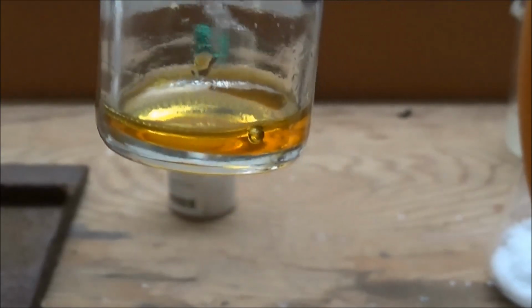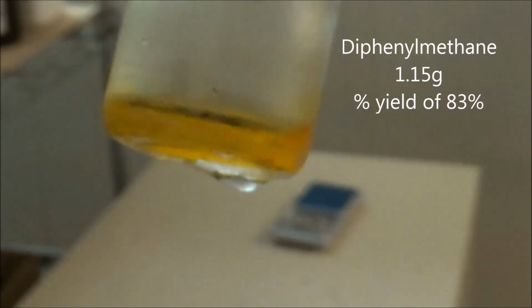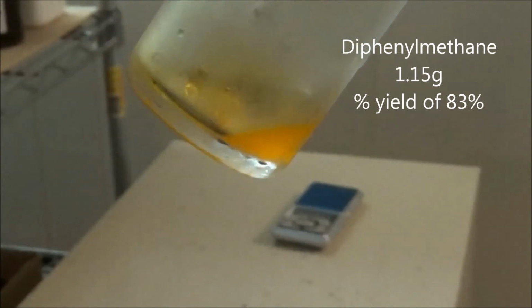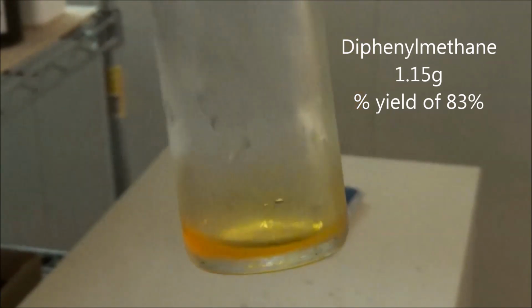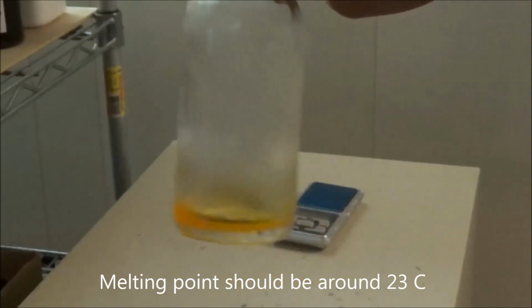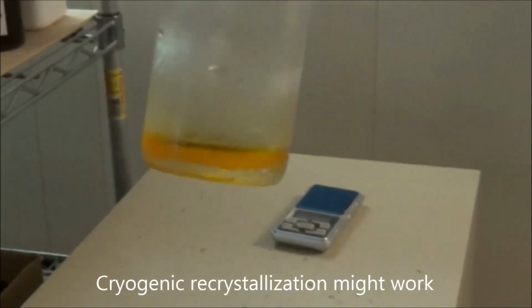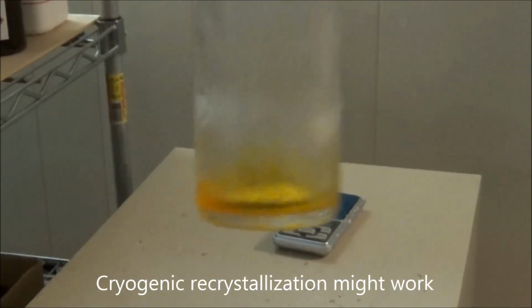I know what you're saying. Tom, how do we know that this is diphenylmethane? Well, the liquid had no odor of toluene and none of benzophenone, which has a very distinctive odor. And its low melting point is what we expected. It does not freeze, probably because it is impure, but unfortunately there's not enough to distill, and recrystallization would lead to oiling out because of the low melting point.